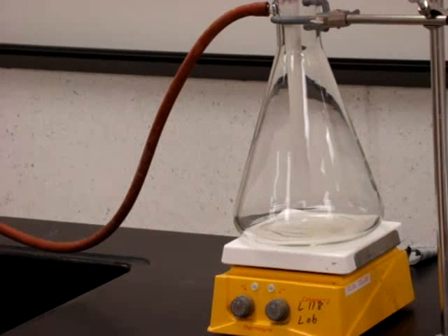Since I know what "nitric acid acts upon copper" means, I'm going to put my pennies in this 4-liter vacuum flask. Pennies in the 1800s were larger than the pennies we have today, so I'm going to use a few pre-1982 pennies, which total about the same mass and composition of pennies from the 1800s.